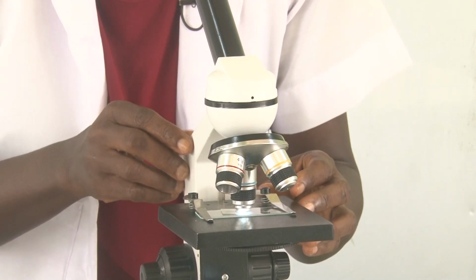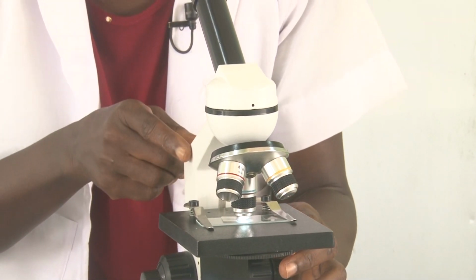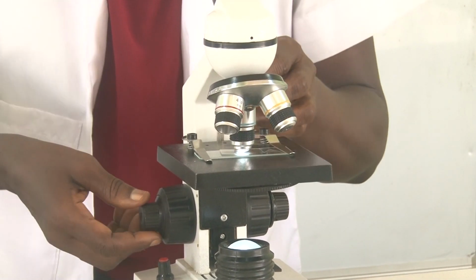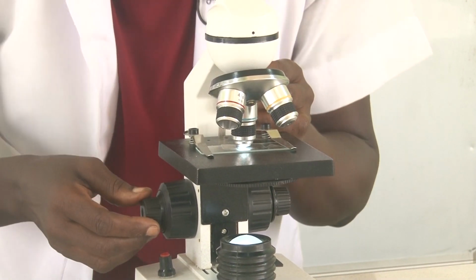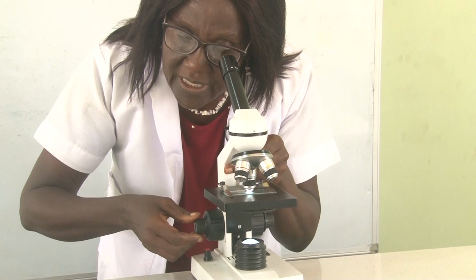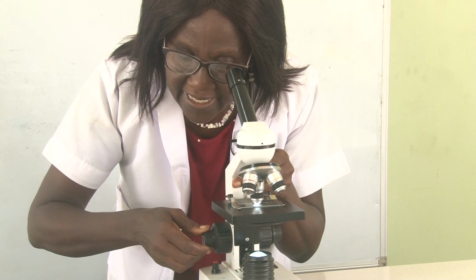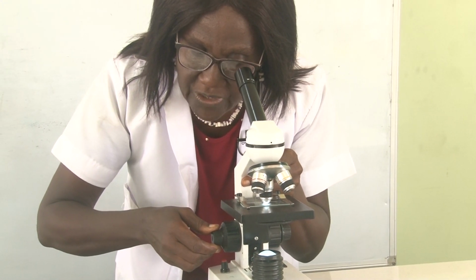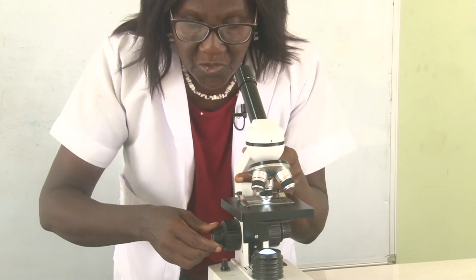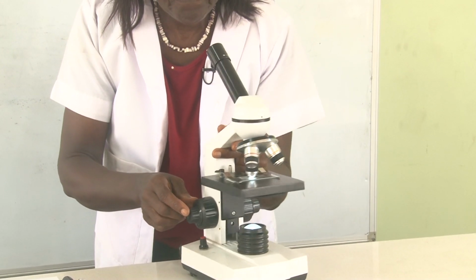Take note that when the high power objective lens is being used, you only have to use the fine adjustment knob. So we are now going to look at our specimen, moving only the fine adjustment knob and turning it down slowly. And here is our specimen very well in view, having used only the fine adjustment knob.